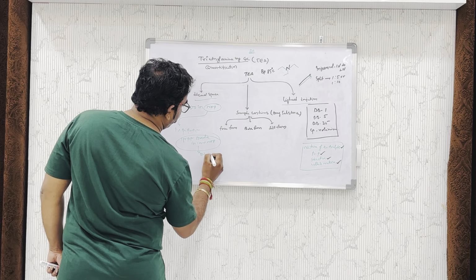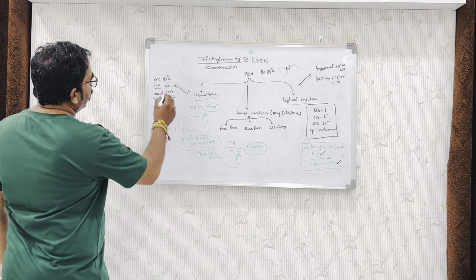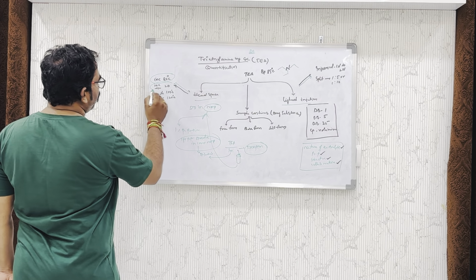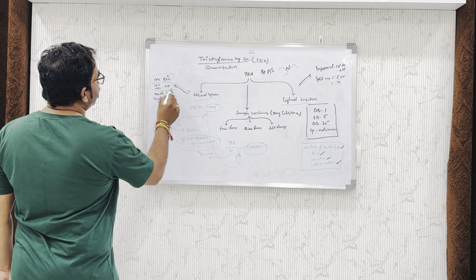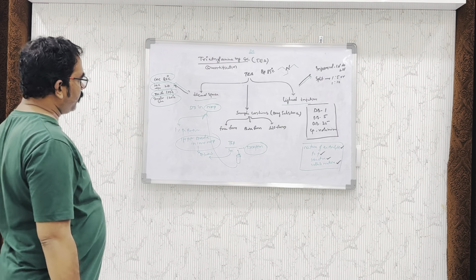When we are analyzing by gas chromatography, we can consider the headspace parameters: incubation temperature 80 degrees, incubation time 20 minutes, needle temperature 100 degrees, transfer line temperature 120 degrees.